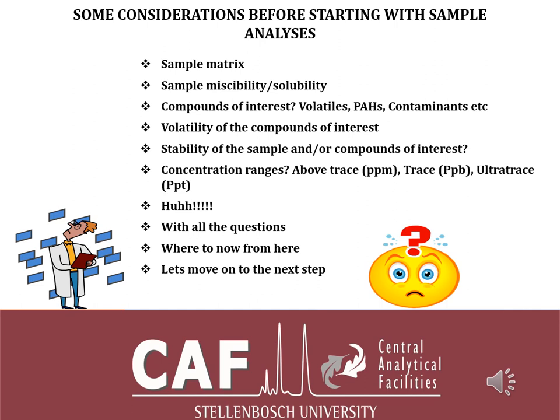When you work at trace in the ppb level and ultra trace, you can start treating them similarly, because you might have to do injection in single ion monitoring mode, SIM, which we're going to talk about later, or you can use MRM, sometimes called SRM. We'll talk about that later when we go into the instrumentation part.